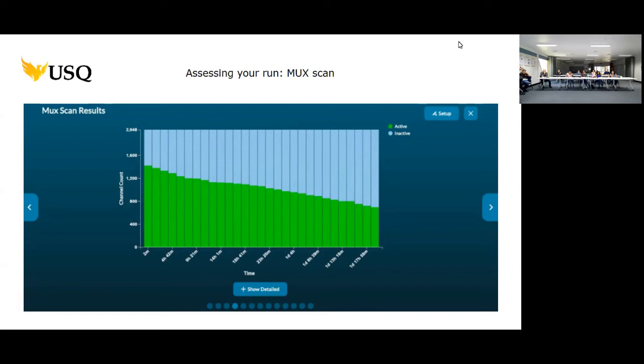It'll just turn a component on. So maybe 25% of them will turn on, and the others will just remain off. And it does this to kind of protect itself. So if something's going wrong, you're only going to lose 25% or thereabouts. The others are going to be protected.